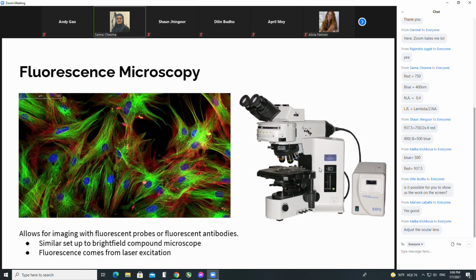It is similar to bright field, but the image that you're seeing is coming from compounds that themselves fluoresce, and we've used those compounds to target particular proteins within the cell itself. Here 3 separate compounds were used to label 3 separate parts of the cell, and then you take 3 separate pictures that the computer is able to superimpose to give you a pretty picture like that.